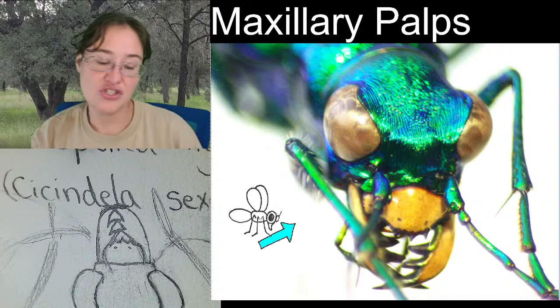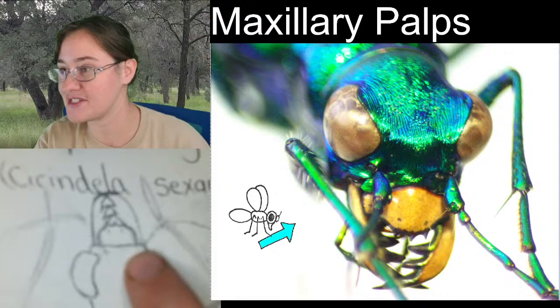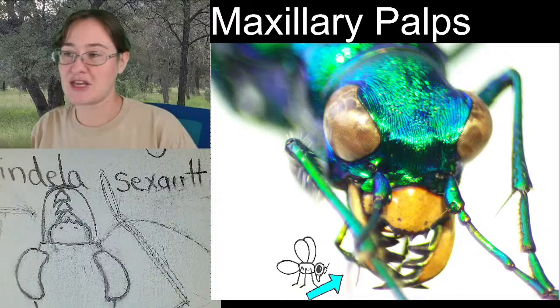Our antenna would be coming out from here. We do have multiple pieces. Well, I wrote maxillary palps and we didn't sketch them, so we would have to sketch them here. Our mouth fingers. These are multi-segmented, and we can see there's a long segment here, and I believe you've got at least another two segments that come in this direction, but they are underneath the mandibles, so they're a little bit more difficult to see and imagine.